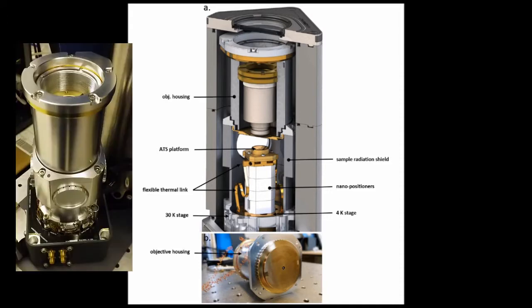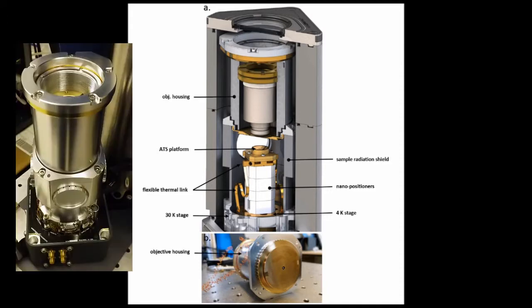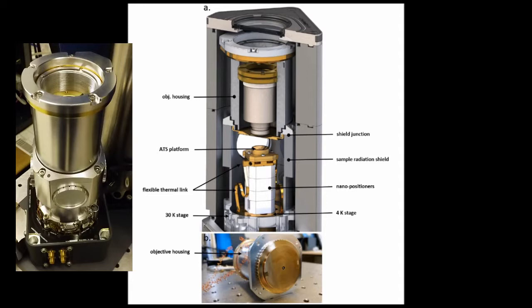The sample radiation shield and objective housing are attached and referenced by mating together at the shield junction, all in vacuum. The enclosure for the optic is threaded and allows vertical, coarse positioning. Although this bond provides a rigid positional reference, the two sections are thermally disconnected within the shield junction.